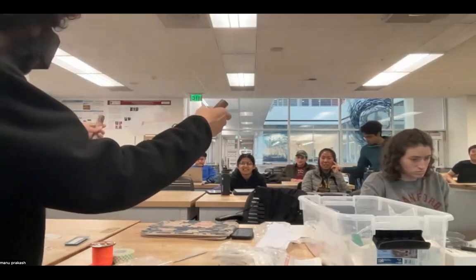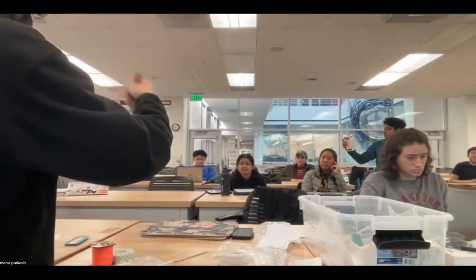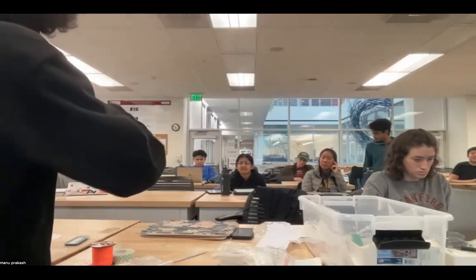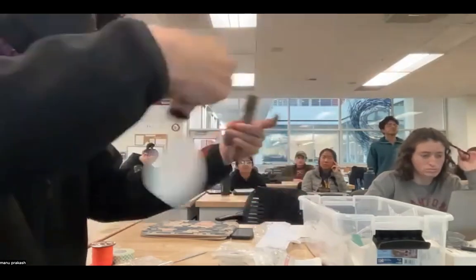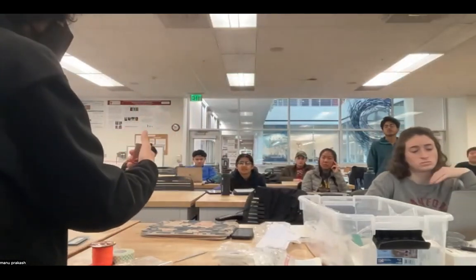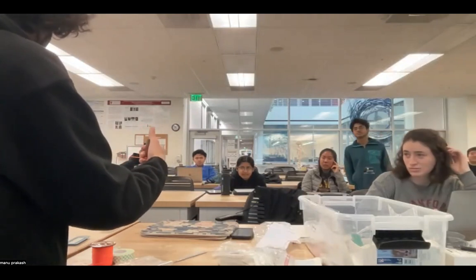I have a known disk. I put handles on now, and I'm going to spin it. This is just first loading, and I can already feel that the weight is a little too low because the inertia matters. Now I've loaded it, and I'm just going to pull. Can you guys hear it? And already the tape failed, but that's okay.